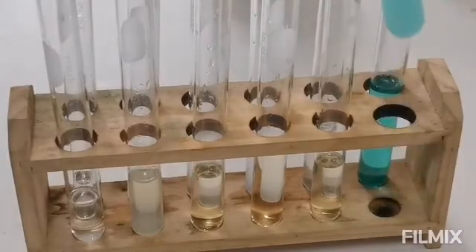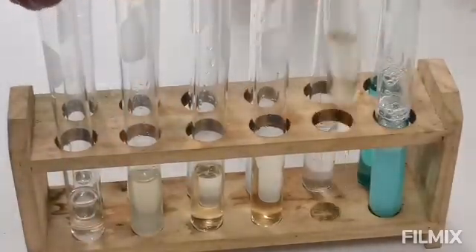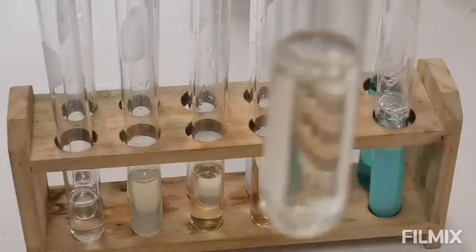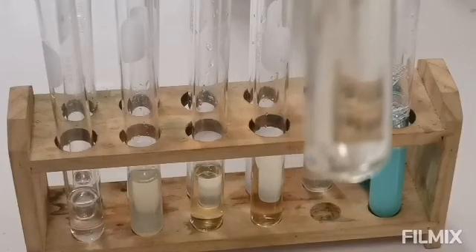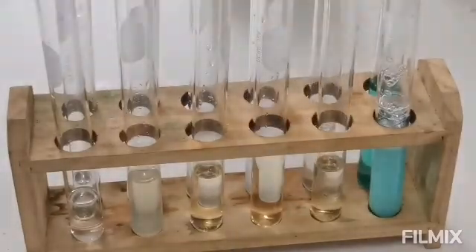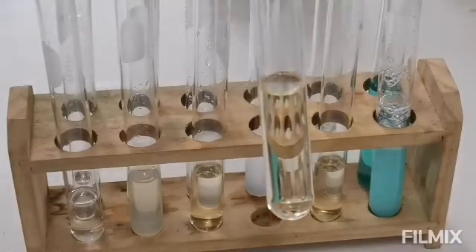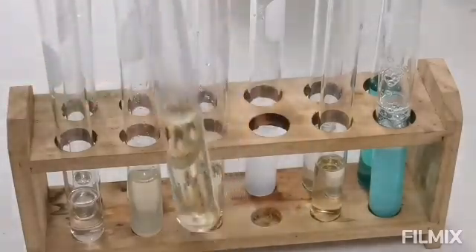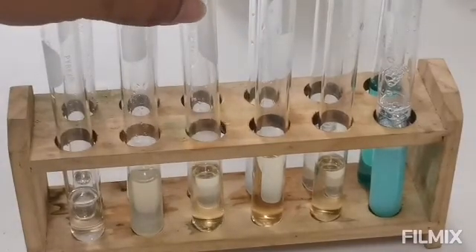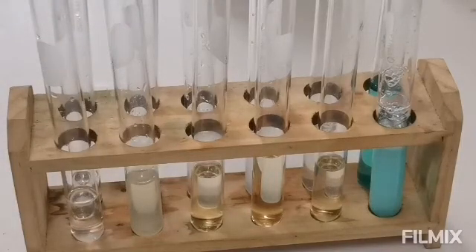Is there a change in this test tube? Is there a change with silver nitrate? You can also observe the side if you wish for possible other colors or reactions. This is with your isopropyl alcohol. Do you see any reaction that had happened? This is with your citric acid. This is with your carbonate, and this one is with your sodium chloride.